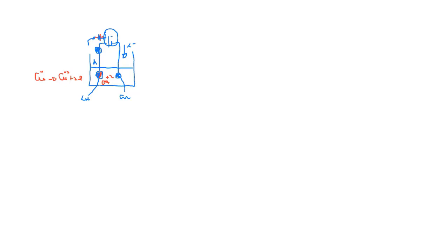And then what do we need to do? Then we will use Excel. I will show you shortly how to do the calculations.